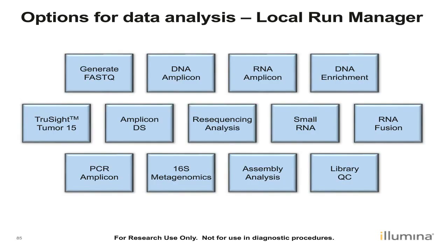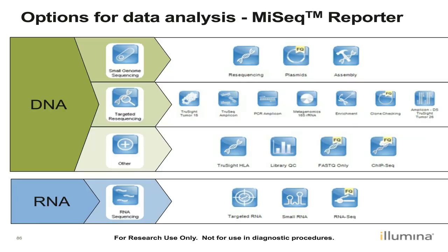Local Run Manager is a no-cost software that can be downloaded and used for data analysis of iSeq, MiniSeq, MiSeq, and NextSeq data. These are the analysis modules currently available within Local Run Manager. MiSeq Reporter is available on the MiSeq and can be run off instruments as well for analysis of MiSeq runs. These are the analysis workflows available within MiSeq Reporter.